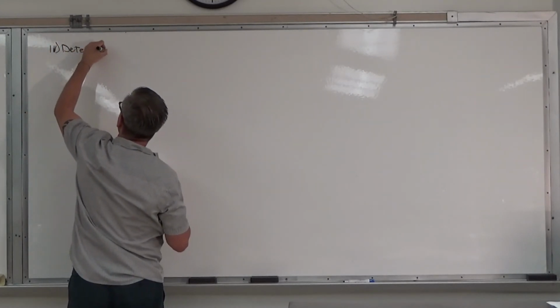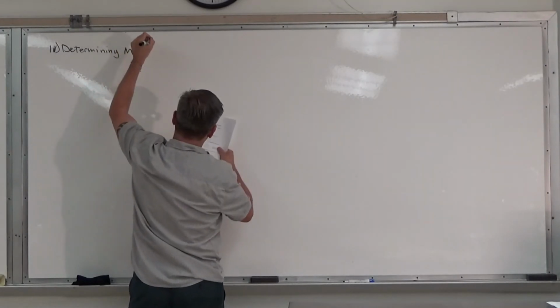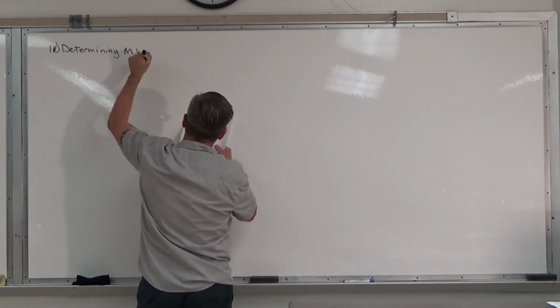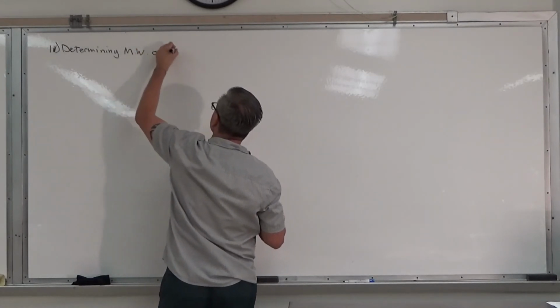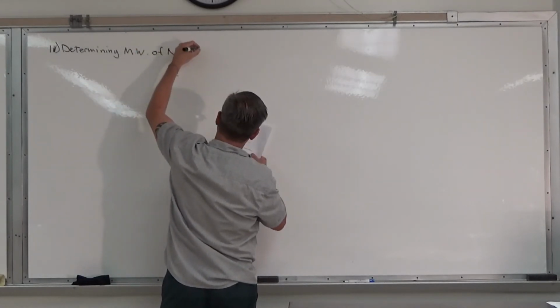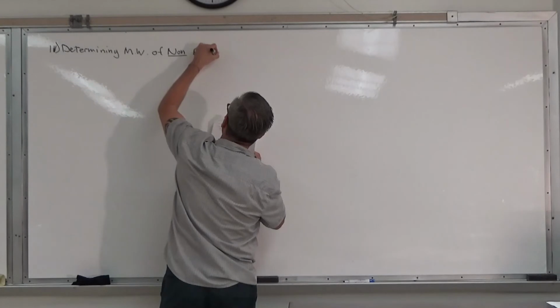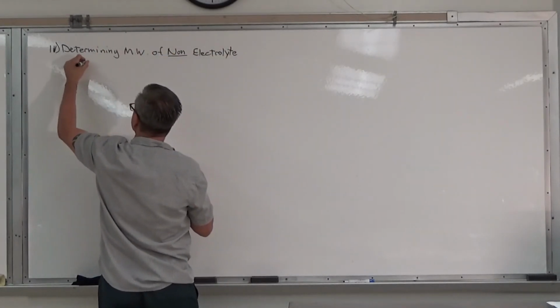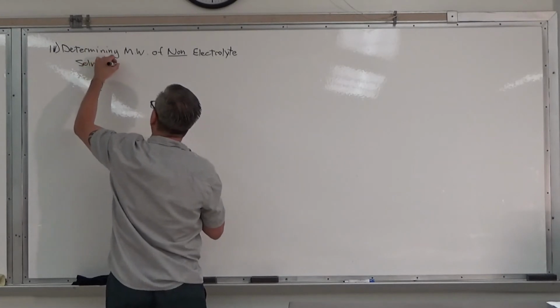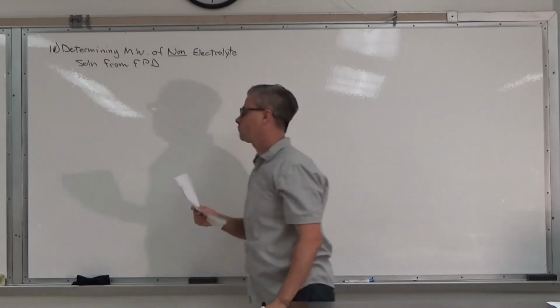Determining molecular weight, which I never like, it should be molar mass, but that's fine, of a non-electrolyte solution from freezing point depression.